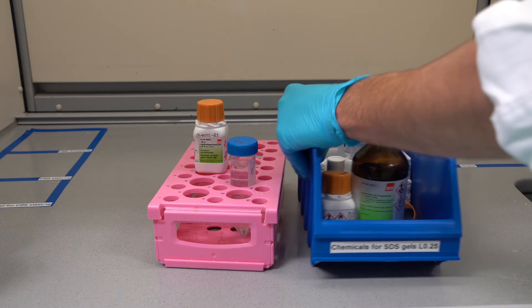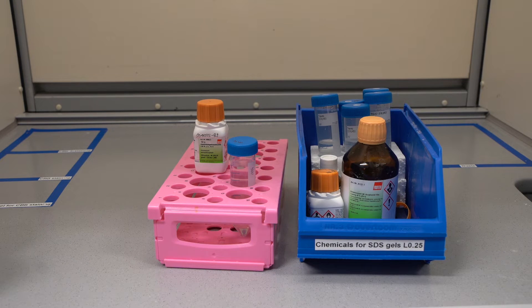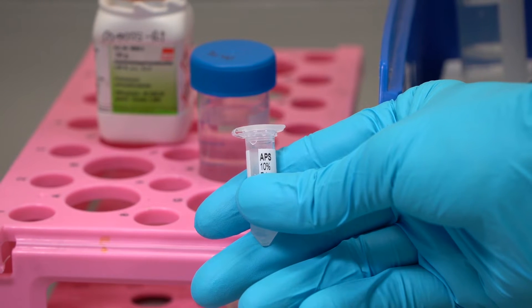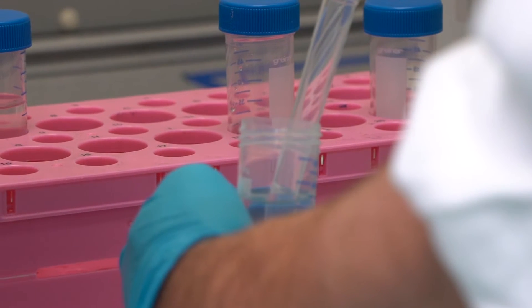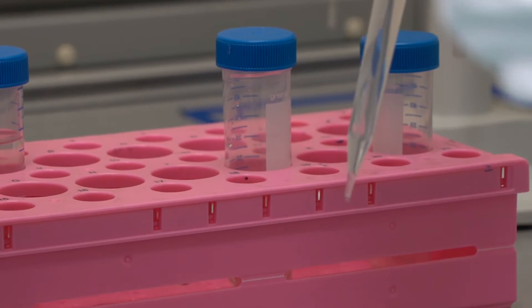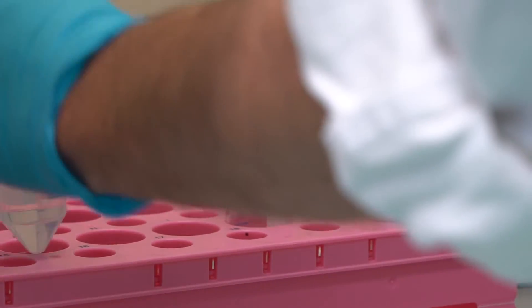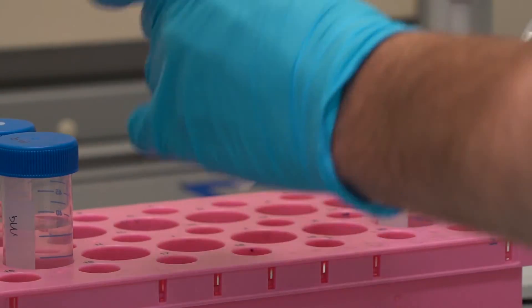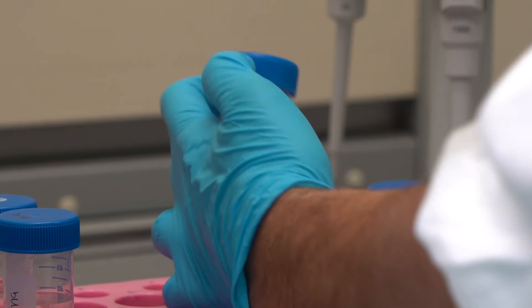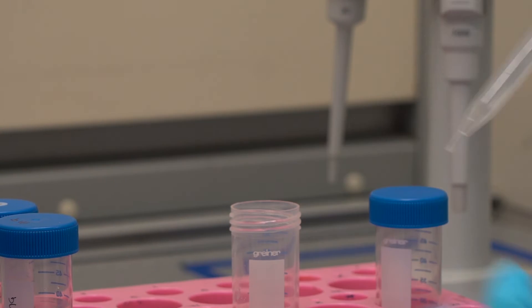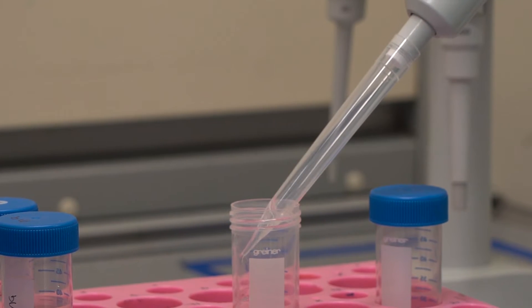To make the gels, you will first need to make a 10% APS solution, and this must be made fresh. You will also need Tris HCl pH 8.8 and Tris HCl pH 6.8, Millicube water, 10% SDS, acrylamide bisacrylamide, your APS, Temed, and isopropanol.